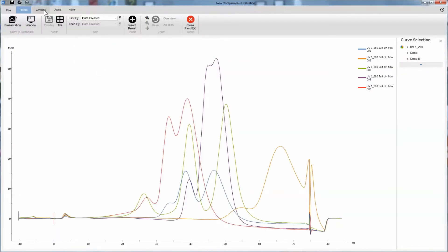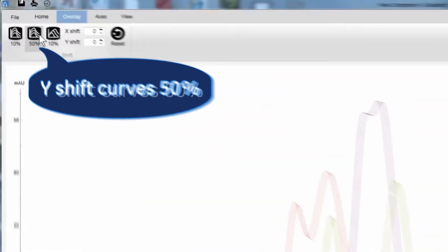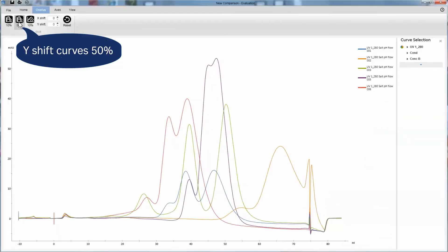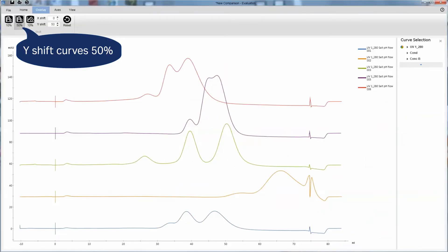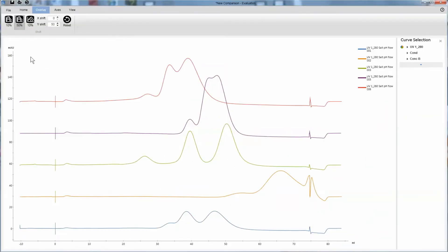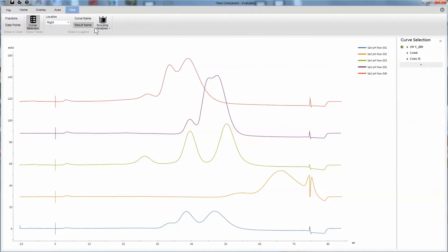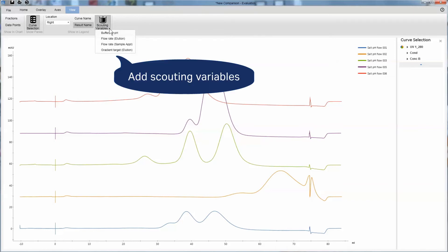To create a clearer picture, you can try shifting the curves. The legend can be adjusted to fit your needs. For example, you can remove the curve name and add the scouting variables.